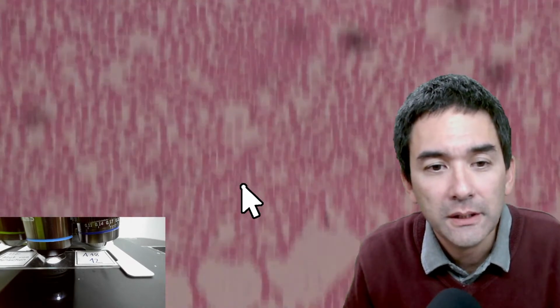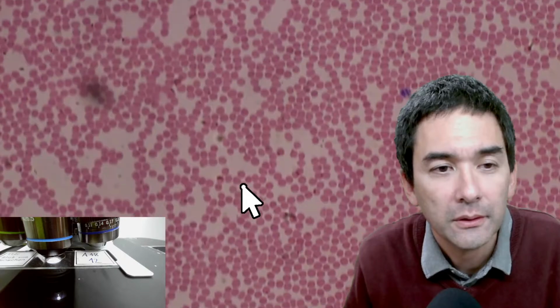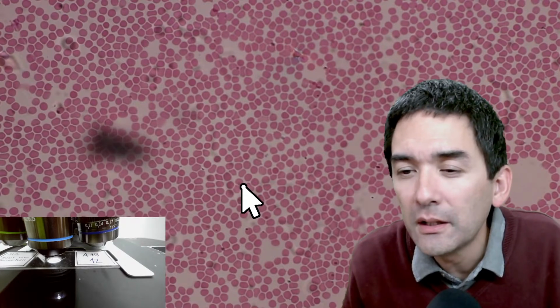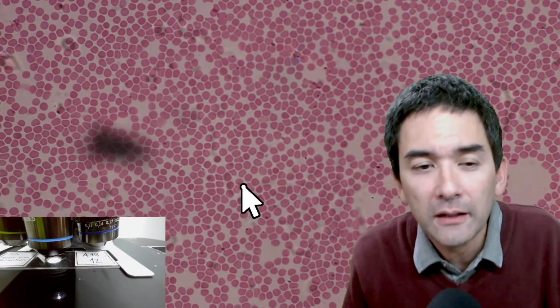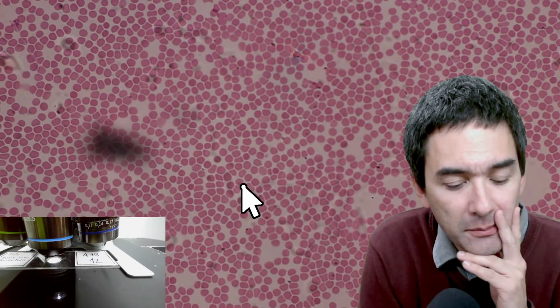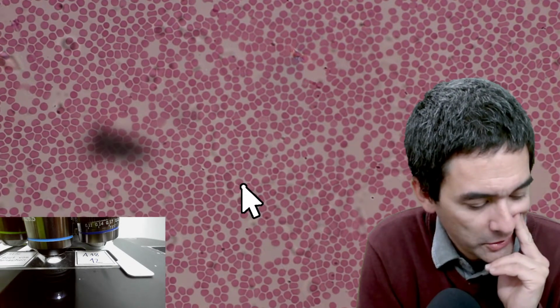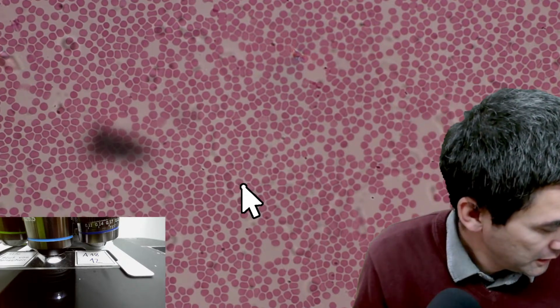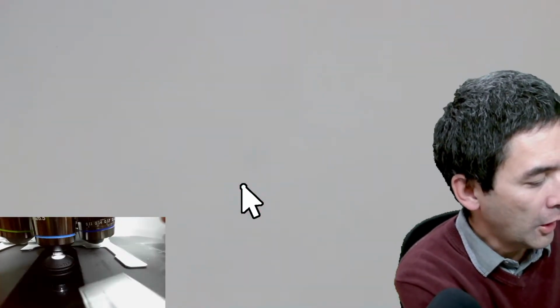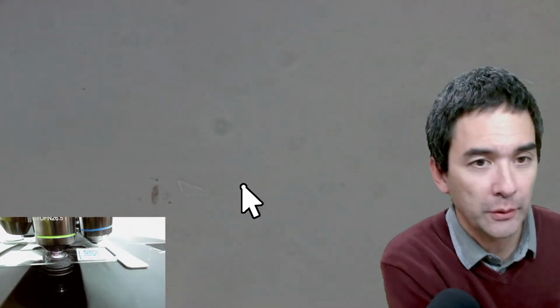So it's basically blood. Here, this is the white blood cell, so maybe we're able to find more. You were actually quite lucky. So the question was about blood vessel density. Is there a way to calculate it? If you look at some tissue, of course you can calculate it. I'm just going to invent a thing. Let's say you look through this rabbit spinal cord. How many blood vessels per square millimeter? I see no reason why I shouldn't be able to do that. You just have to count them.